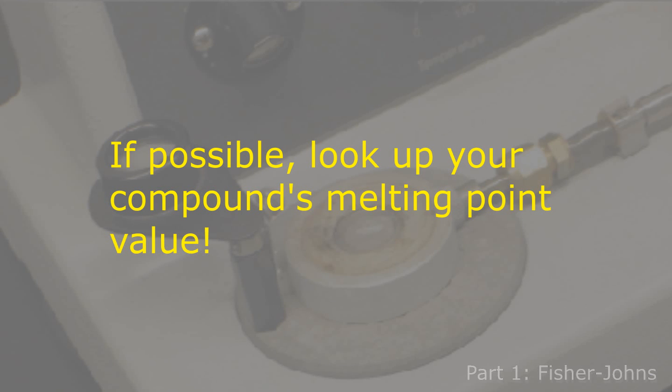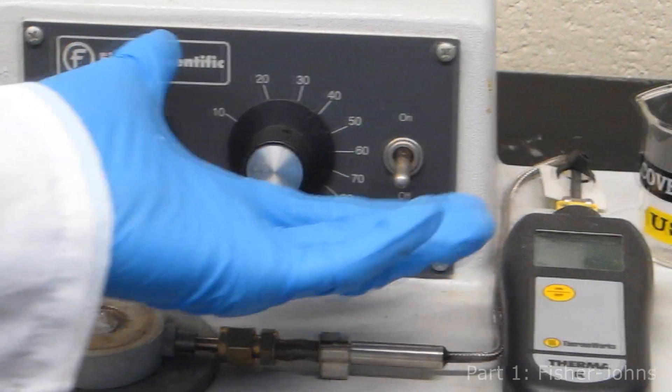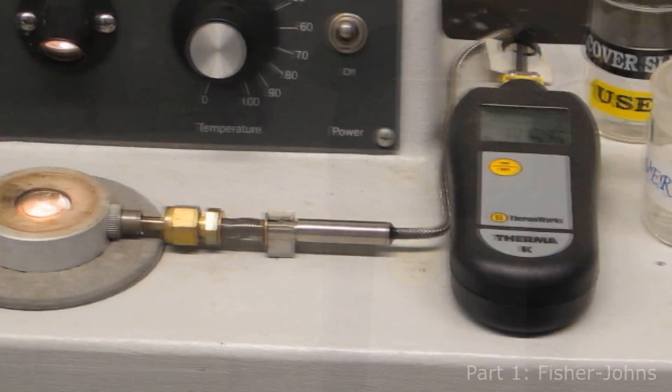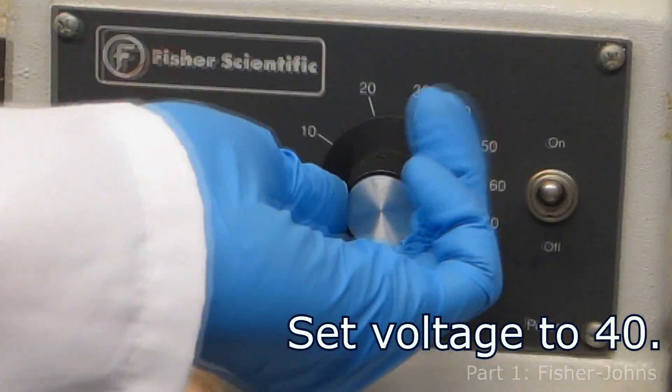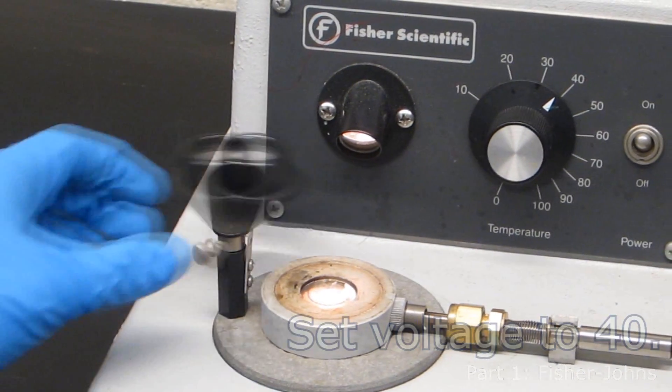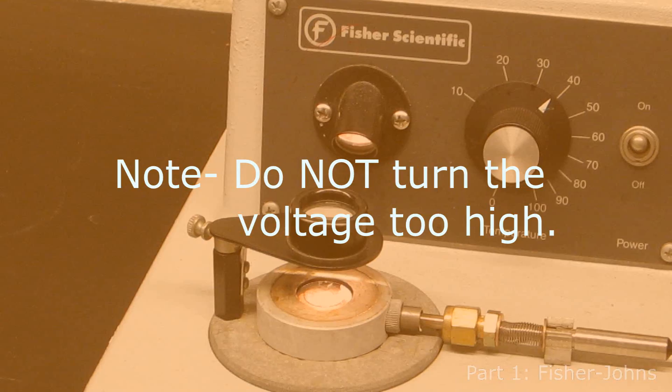If you know the identity of your compound, be sure to look up its literature melting point value prior to the experiment in order to confirm the accuracy of your observed value. Turn the instrument and thermometer on. Set the voltage to 40 in order to get within 20 degrees of the suspected melting point. Do not turn the voltage too high — if the temperature increases too quickly, inaccurate results will be obtained.